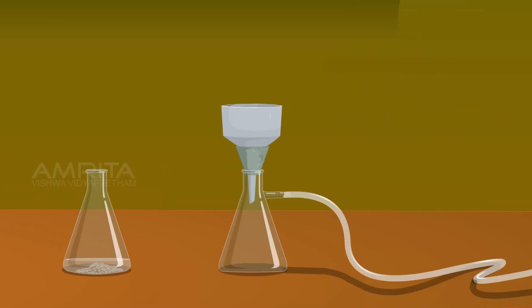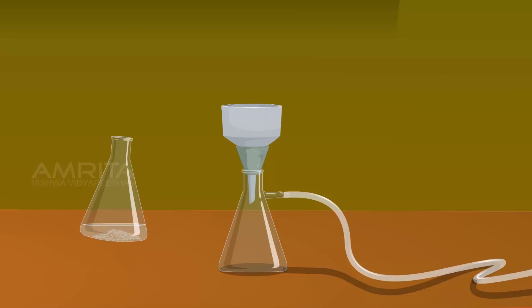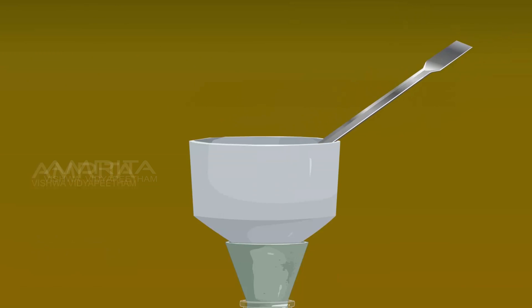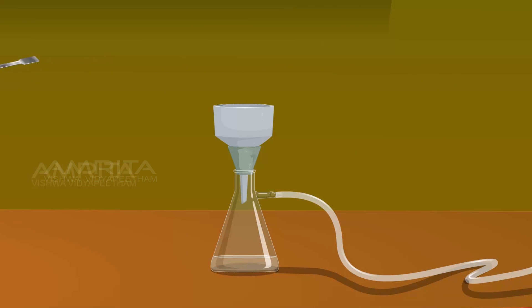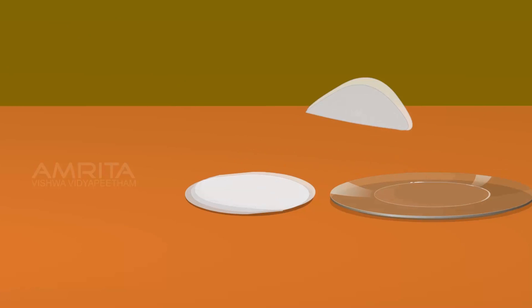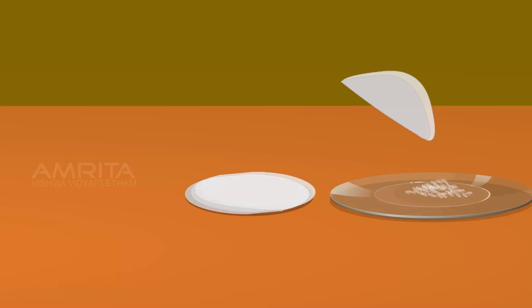Place a filter paper in the Buckner funnel and filter the crystals. Take the crystals from the funnel using a spatula, transfer them onto a filter paper, and dry the crystals by pressing them between filter papers. Transfer the crystals into a watch glass and label it as acetanilide.